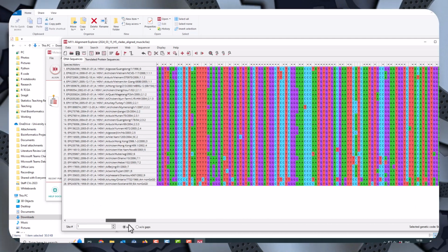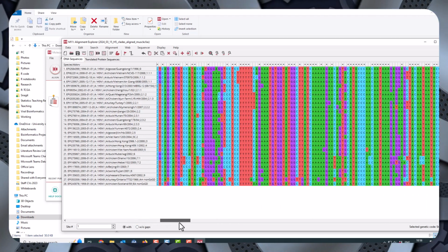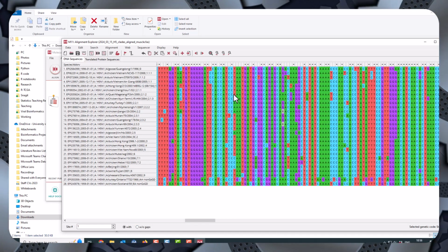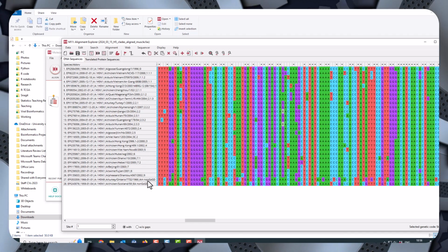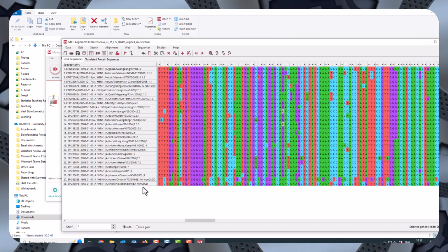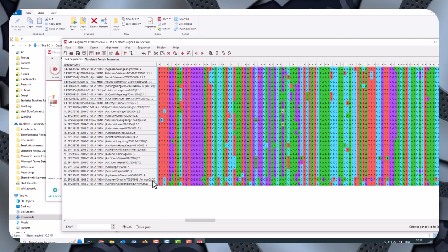Now, to do that, the first thing I need to do is have a good alignment. For the H5s, because they're all very similar to each other, alignment is not terribly difficult, so you can see here that there's lots of stars. I've got the start codon set, as you saw. Everything's pretty good. And I've got dates for each one of the sequences. I've taken the oldest one of each of the sequences.